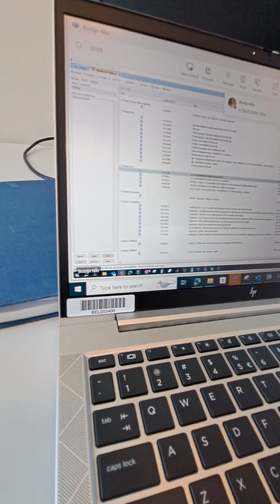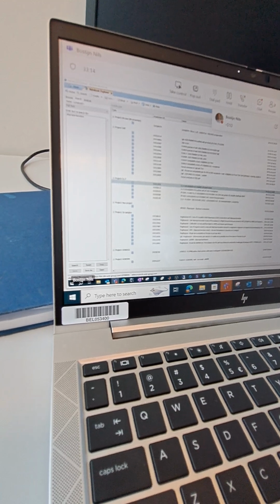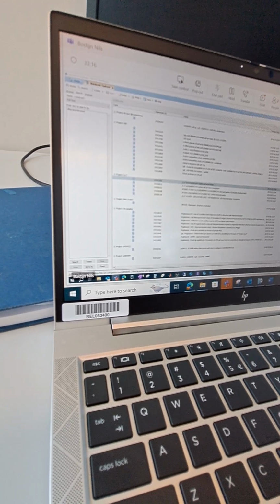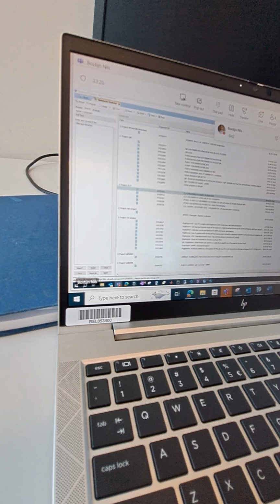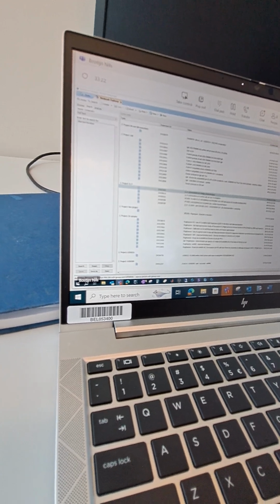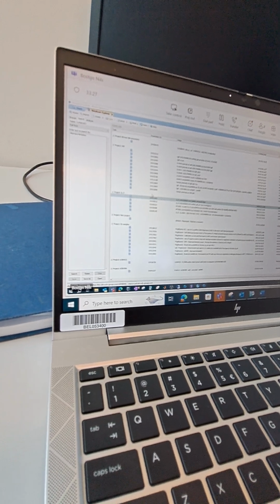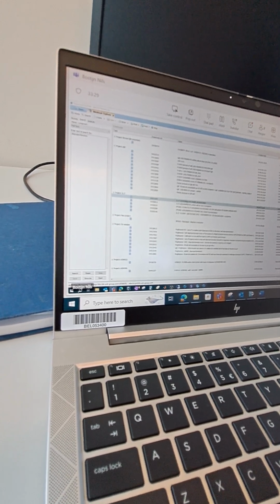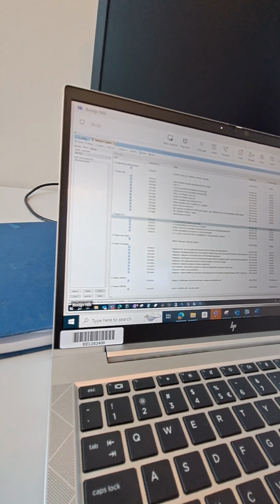When we have a chloride salt, I think it's 010. When it's a sulfate salt, it is 042, I think. Yeah, 042. And so on. Usually we use the last 4 digits to say it, 8995, because otherwise it's long.